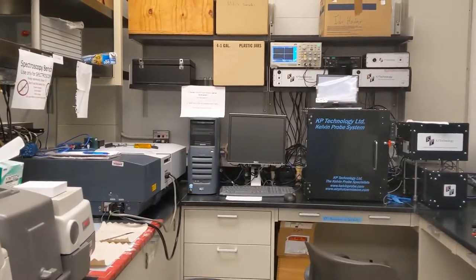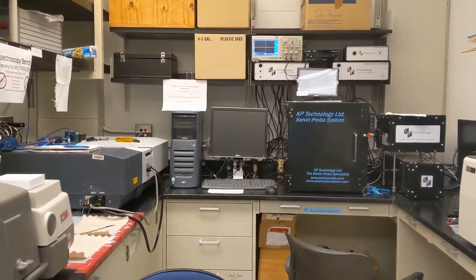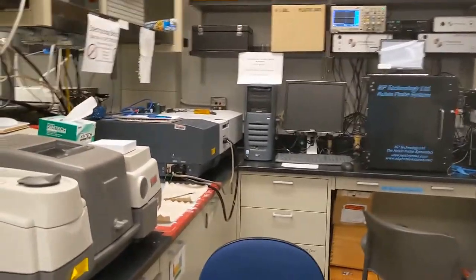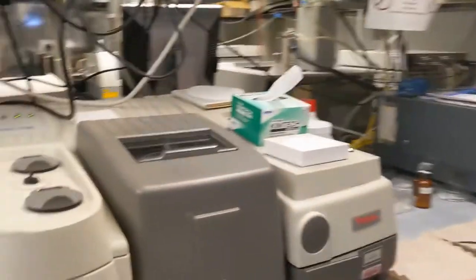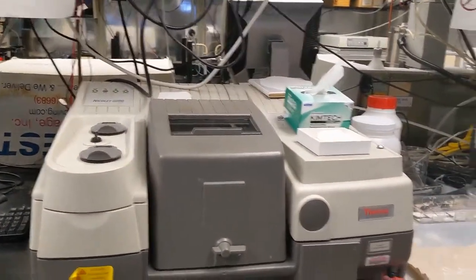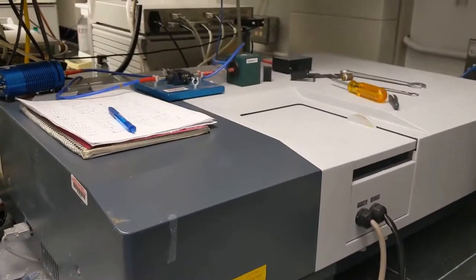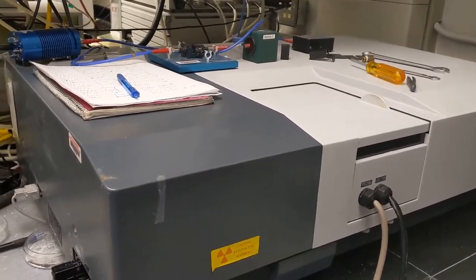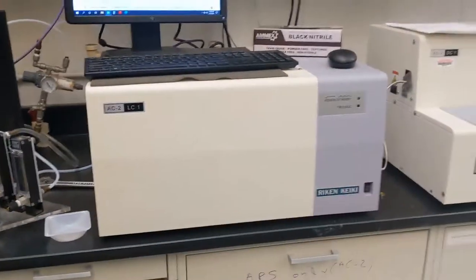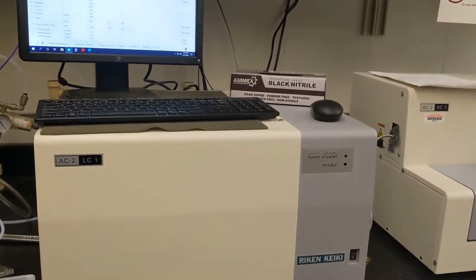So once you've made nice crystals, it's time to characterize their optical properties with the instruments we have in this part of our lab, starting with the IR instrument. Then we have UV-vis absorption spectroscopy for characterizing the band gap of the material, as well as an instrument here for photoemission yield spectroscopy.